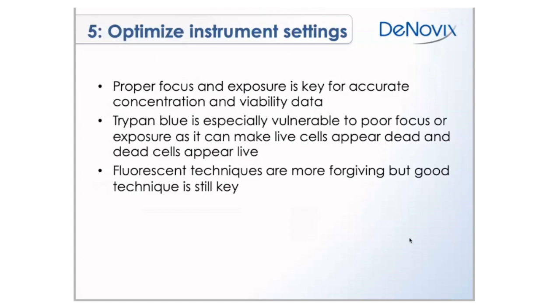Fluorescent techniques tend to be a little more forgiving, but good technique is still important. That's something that we hear a lot from customers. They'll send us images, they'll say our counts aren't right, and we'll look and their focus is out, and they think that because it's fluorescence it shouldn't really matter that much. But as we'll see in some examples here, it definitely does matter, and it's important with fluorescence as well to make sure that you have good focus and exposure.